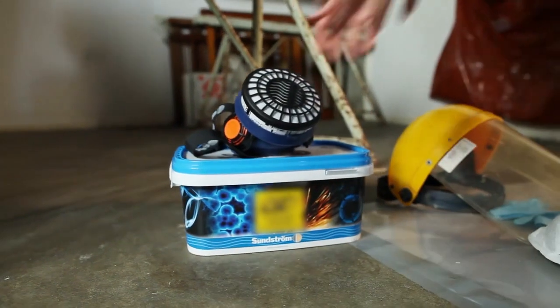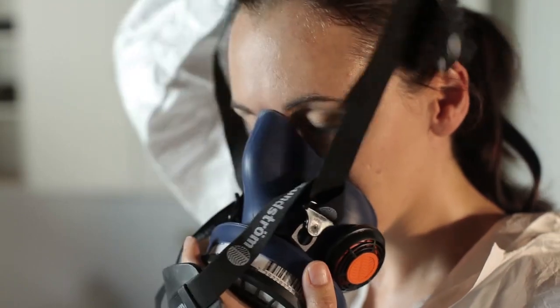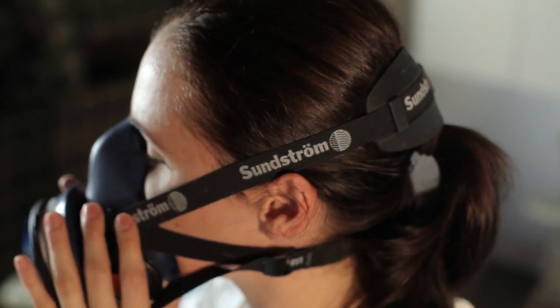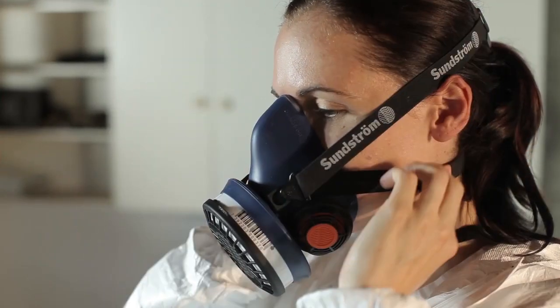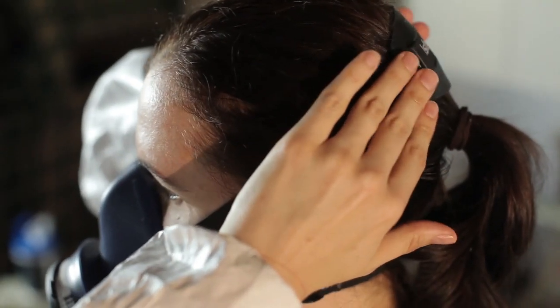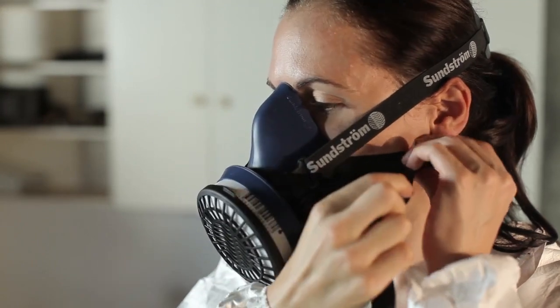To put on a reusable respirator, loosen the straps. Place the respirator over your mouth and nose. Place the bottom strap behind your head, ensuring long hair is moved from under it. Pull the top strap over your head, making sure the head harness is on the top of your head. Tighten the straps and check the fit, so it fits securely to your face.